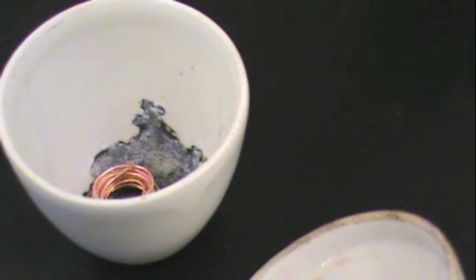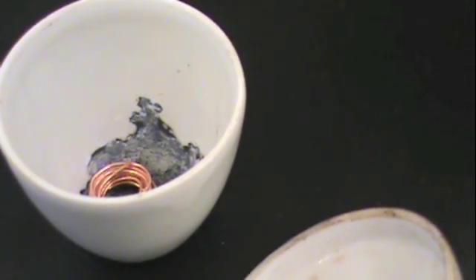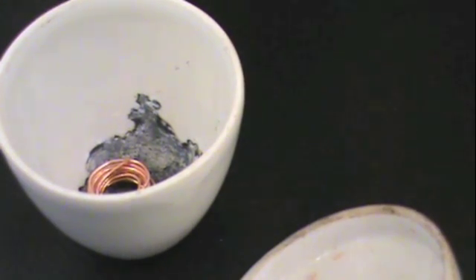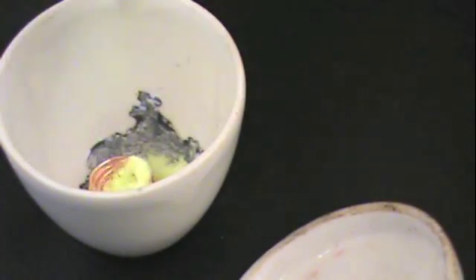Weigh a crucible and lid, and then obtain a piece of copper and coil it around a pencil to get it into the shape shown here. You will then re-weigh it.